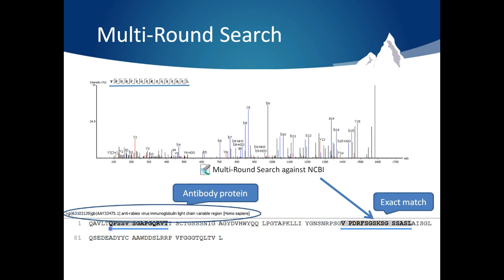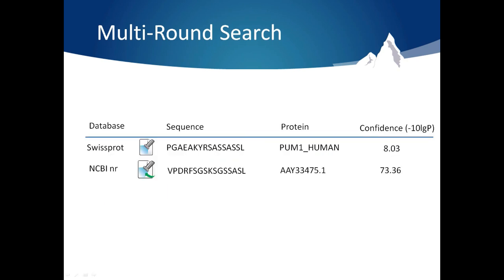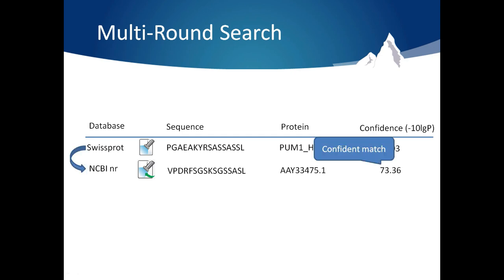Here is a summary of the hits we were able to find with this spectrum. Searching SwissProt, we identified an unexpected protein with a low score, likely a false positive. Now with Multi-Round Search, we achieve ideal results where we identified a peptide from an antibody protein with a high score and no mutations.